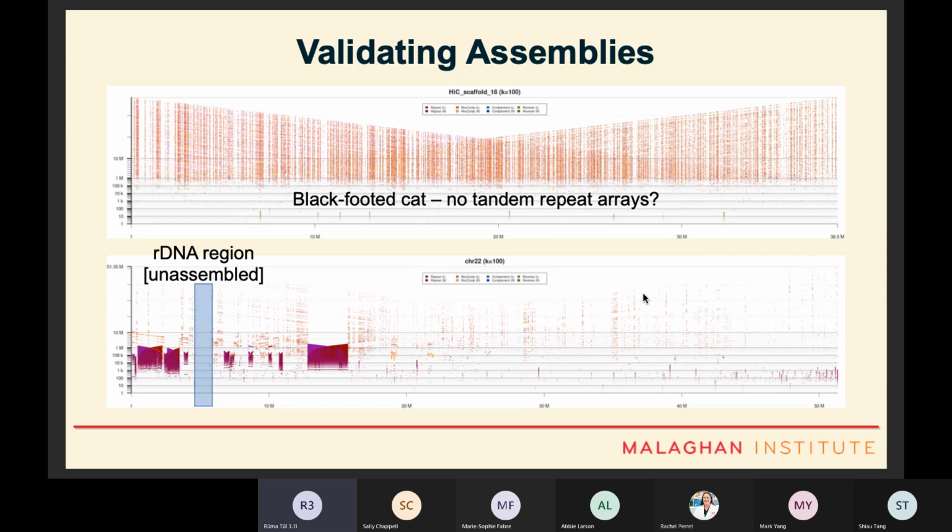Currently, people use a process called Hi-C, where I think they break up the chromatin and use that to attach distant pieces in the genome together to find out DNA sequences that are close in three-dimensional locality, but far away in terms of the genome sequence. One of the issues with Hi-C, which is most commonly used, is that it uses Illumina sequencing for identification.